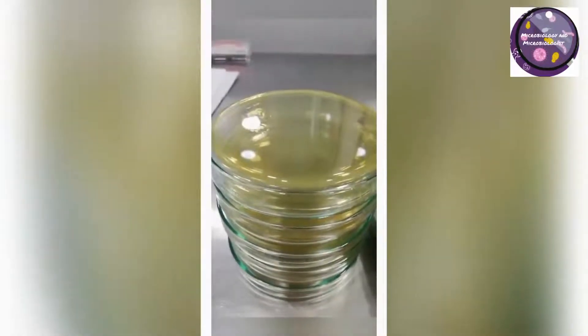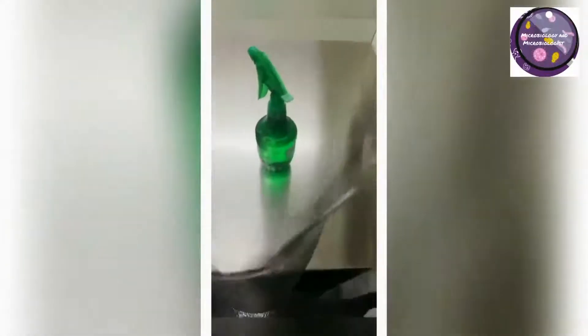First, I will disinfect or sanitize the laminar airflow hood. When you are using disinfectant under the laminar airflow hood, make sure all switches and sockets are switched off, because it may lead to a short circuit or other electrical issues that could be quite dangerous.